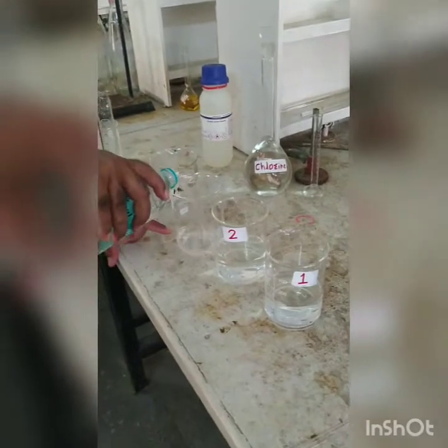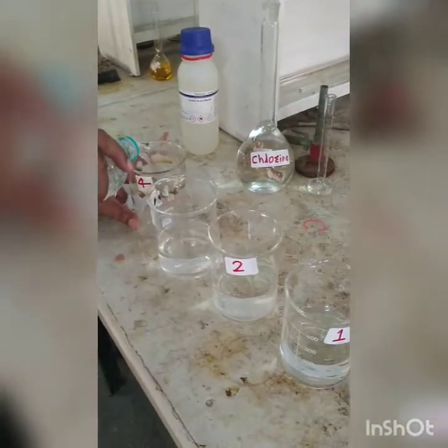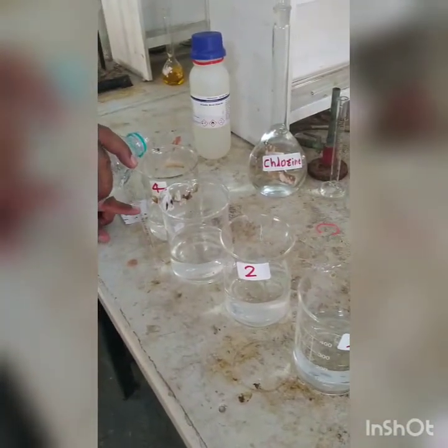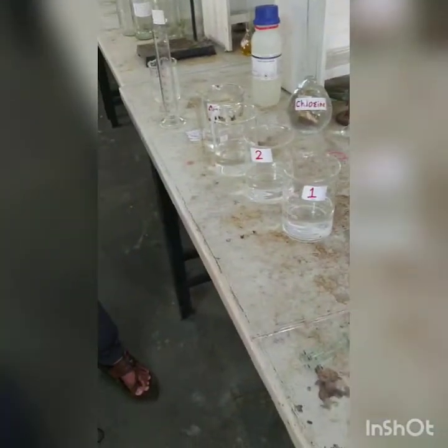From the experimentation that we have done, our value of X in standardization was 10.5 mL. The actual normality of sodium thiosulfate is 0.001, against that we have got a normality of 0.00095, and Y mL during determination of chlorine was 20.